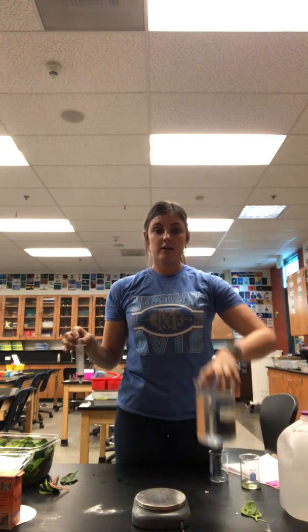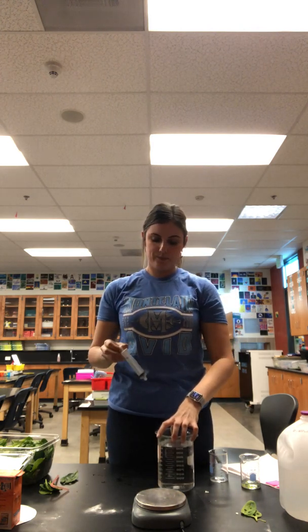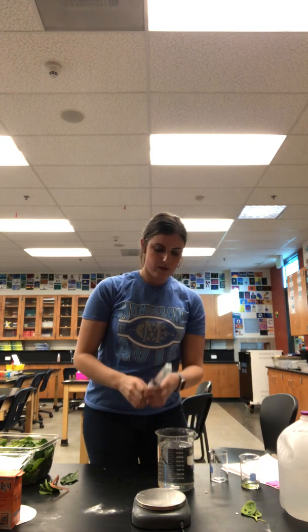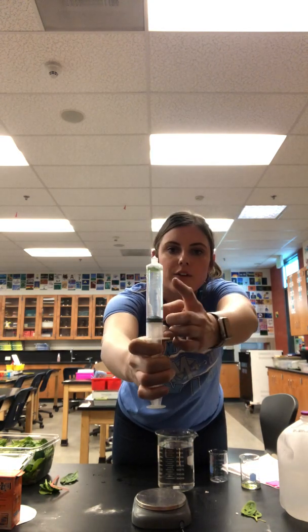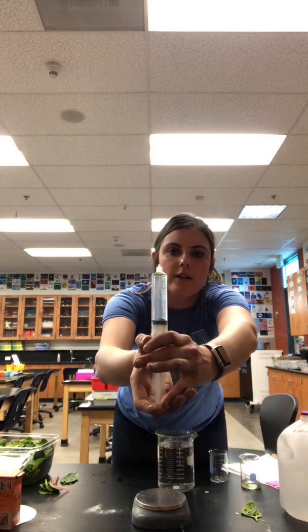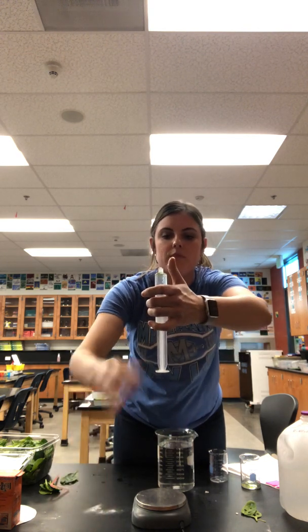From there, I'm going to pull up some of our sodium bicarbonate water solution, and so I have those leaf chads in the solution. If you can see, I have a little bit of an air bubble at the top. To get rid of that, I'm just going to push up until the water rises and there's no more air bubble. Some water might spill out and that's okay.